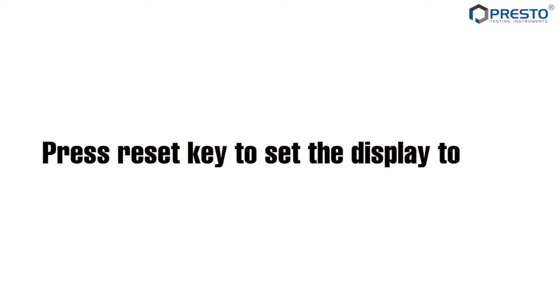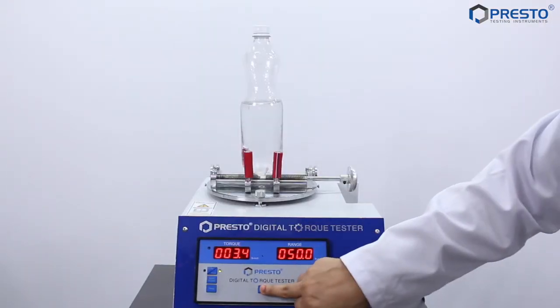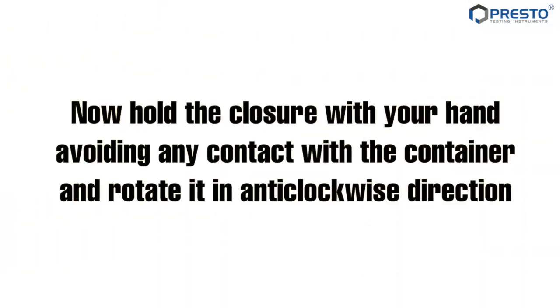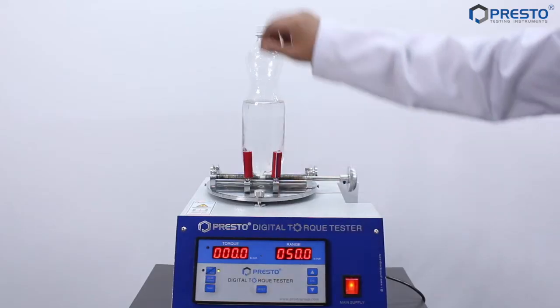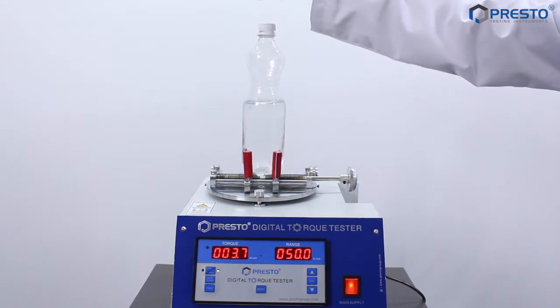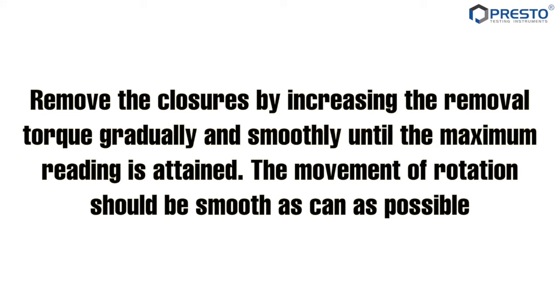Press the reset key to set the display to zero. Now hold the closure with your hand, avoiding any contact with the container, and rotate it in an anti-clockwise direction. Remove the closure by increasing the removal torque gradually and smoothly until the maximum reading is attained.